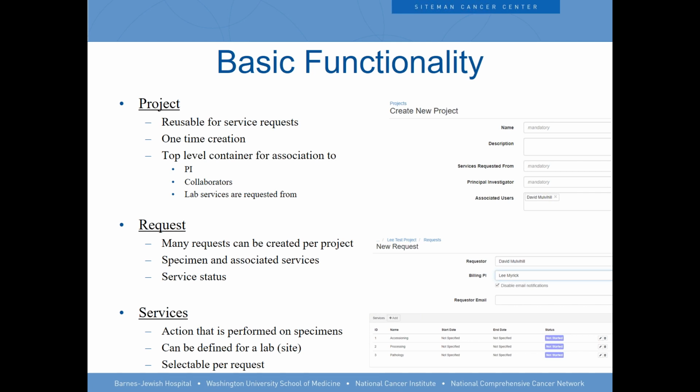Yeah, that's a good question. This workflow that we talked about is only for internal, and I don't think we ever had a request for an external institution going through projects, right, Lee? Yeah, we haven't had that. Yeah, I don't think there's anything that would stop it, because we do allow external access to OpenSpecimen. It is publicly available outside the Washington University network. So yeah, I don't think there's anything that would stop us from doing that.